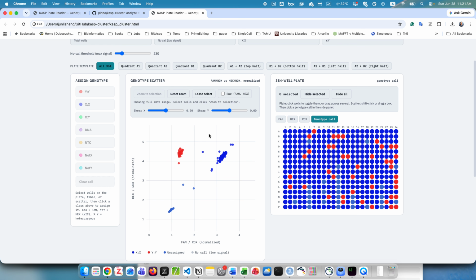This is just a mimic of Cluster Caller, the commercial software. It's very expensive for a new lab like us, so that's why I just used Claude Code to write this free software. Cluster Caller has X correction and Y correction. I think they didn't show you the algorithm. I think it's just like a shear transformation.